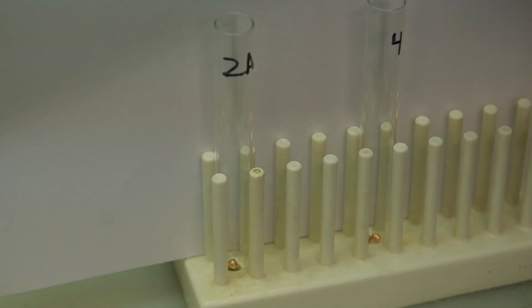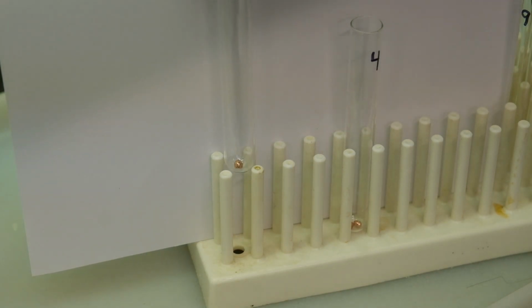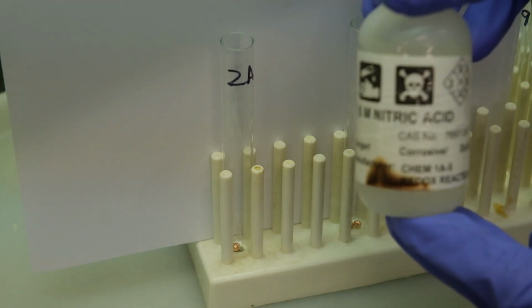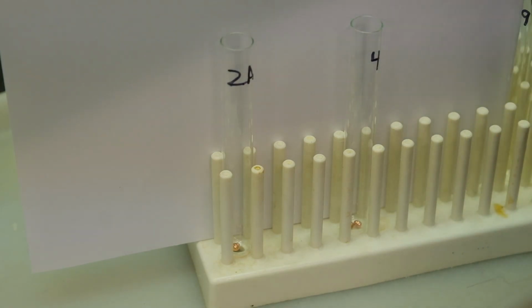So this is experiment 5, system 1. Inside this test tube we have 1 copper shot, and we're going to be adding 5 milliliters of the 6 molar nitric acid.